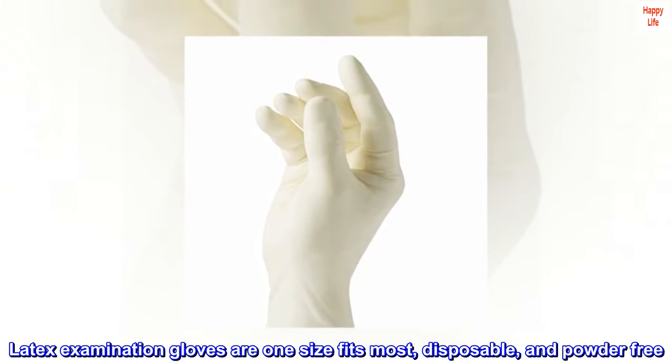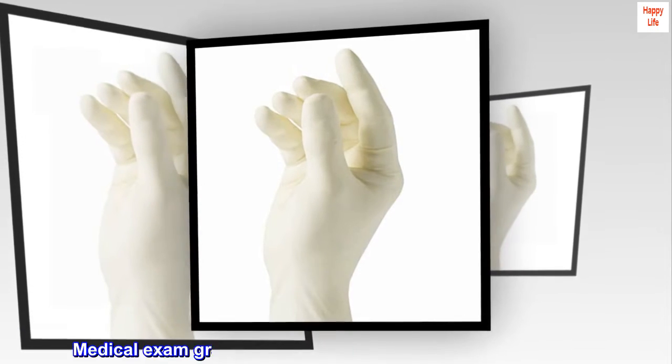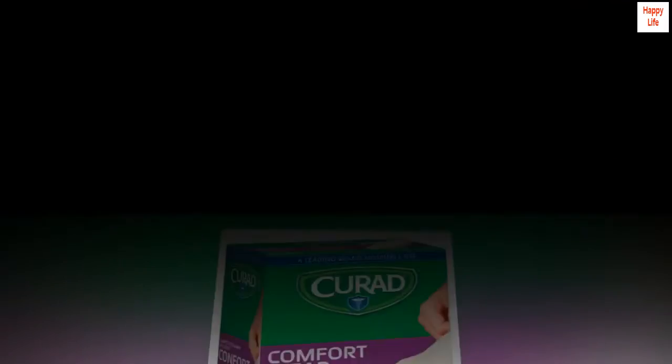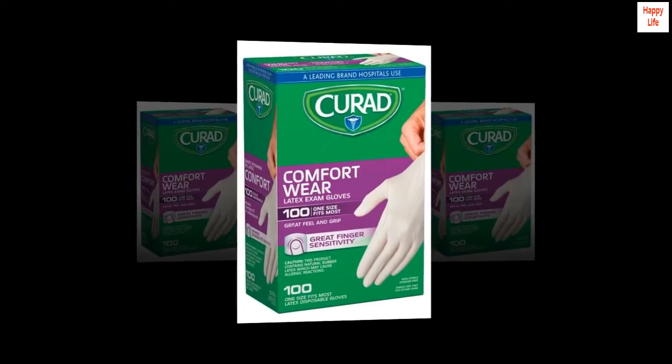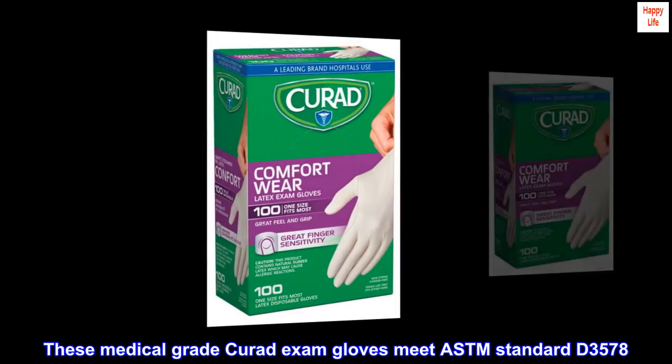Latex Examination Gloves are one size fits most, disposable, and powder-free. Medical Exam Grade Gloves are made with natural rubber latex. Box of 100 gloves. These medical-grade Curad Exam Gloves meet ASTM Standard D3578.